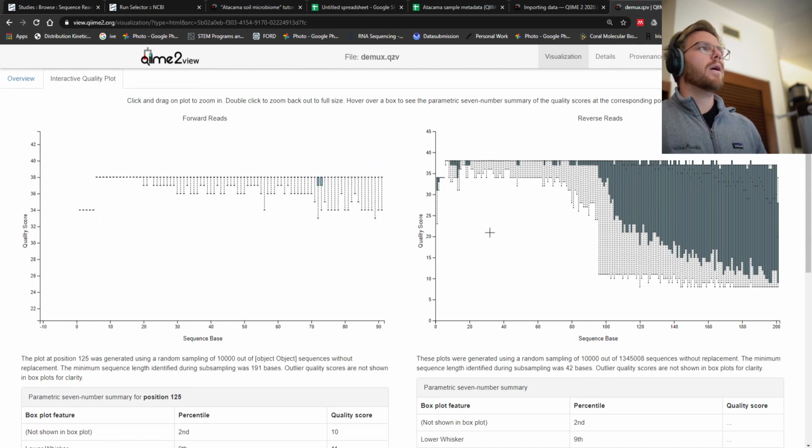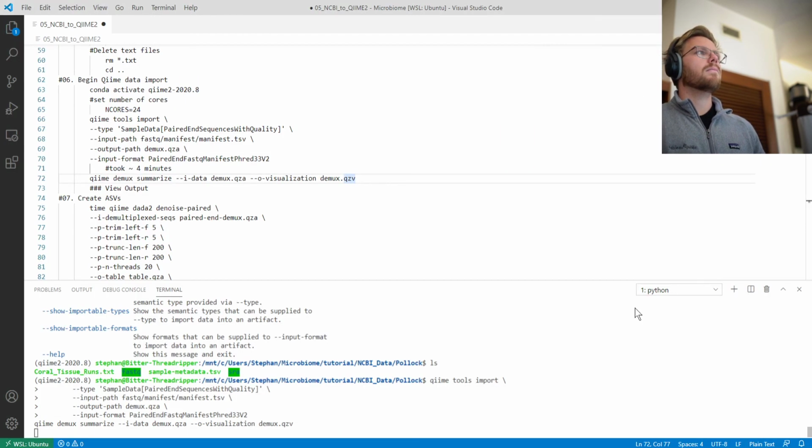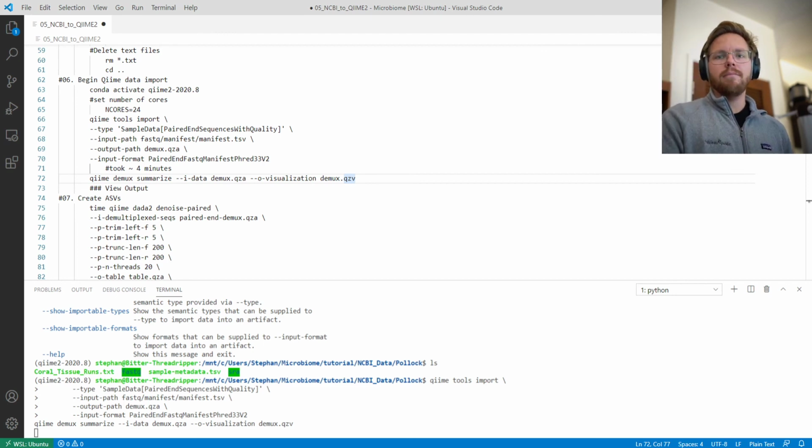And so I hope that is useful for you guys for downloading all these data sets. Not too difficult, but it does take some time, especially if you're learning from scratch. And with that, I wish you good luck. Thank you.